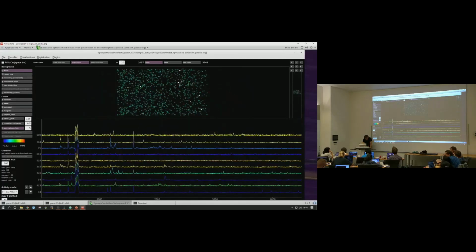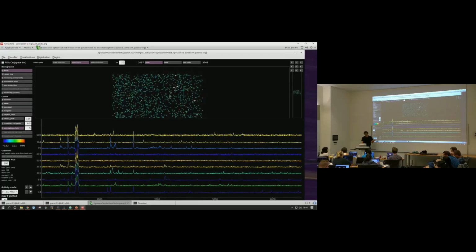If you look at their traces, I can see that they're all active at this time, maybe also a little bit here. Maybe there's some coactivity here. So that's why all these cells are active. This is not a very long recording, so it could be by chance that these cells happen to be active during that period. Although I'd be surprised. They all have these nice bimodal responses. All right, it already looks pretty convincing. Maybe they're responding to similar kinds of things.